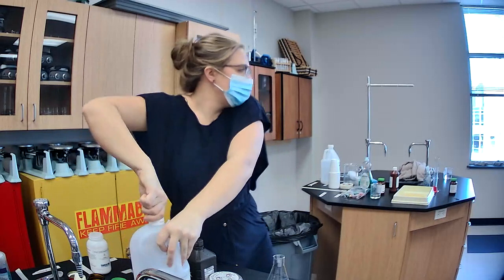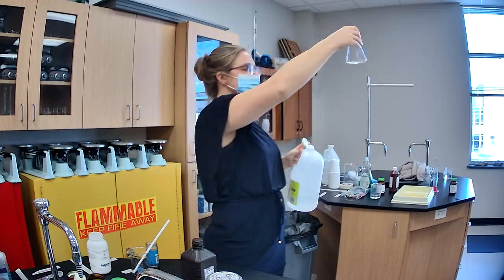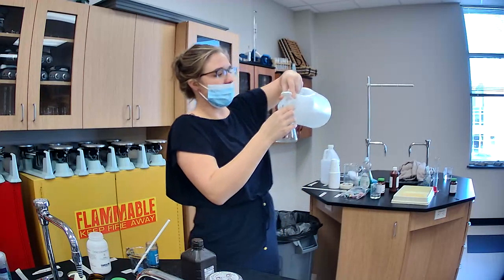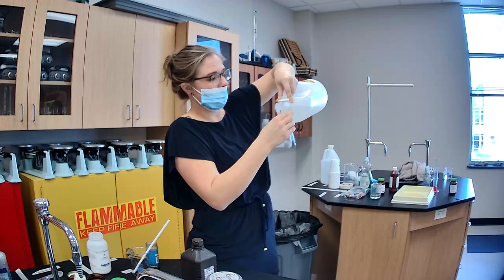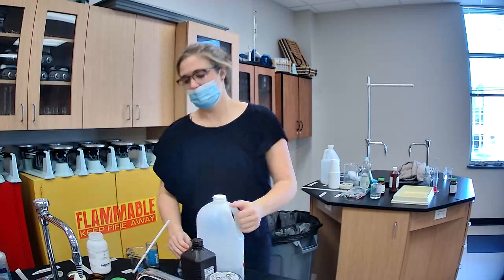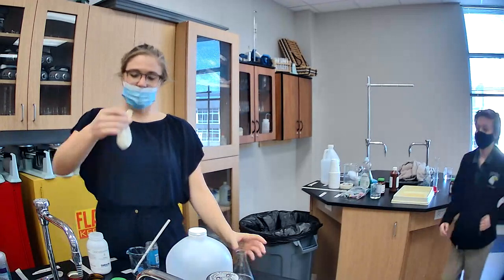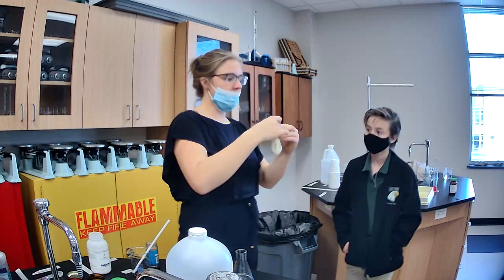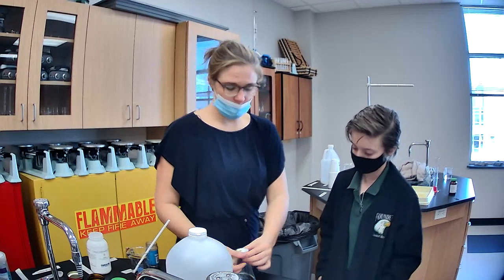So this one, I've got my flask. Jacob, you with me? I'm going to fill it up with vinegar, which I hate because vinegar smells awful. Alright, and then Jacob, you can come on up here. I've got a balloon. In the balloon, I've got baking soda. I'm going to wrap the balloon over the top of the flask and hold it up.